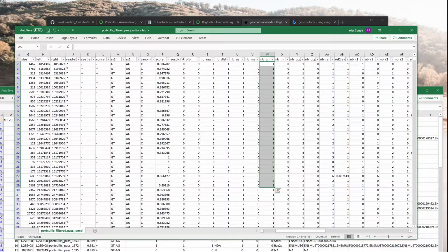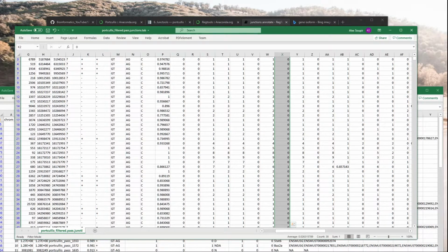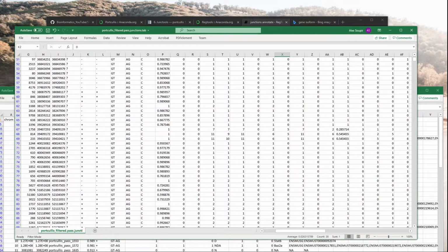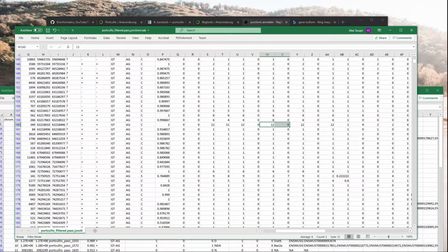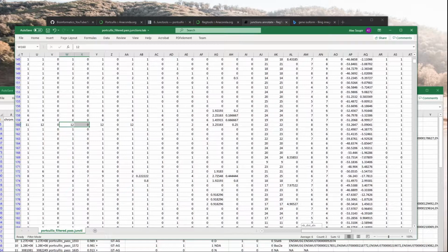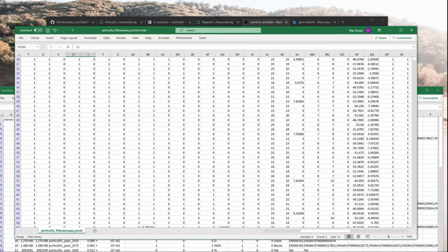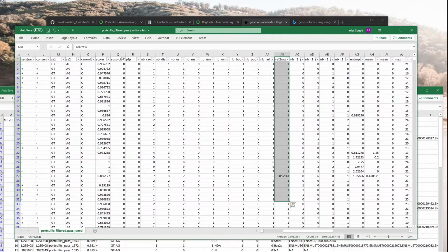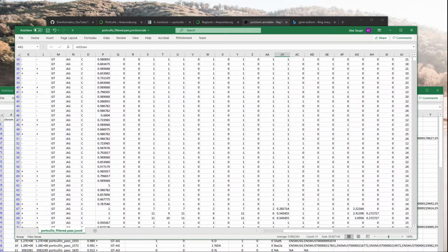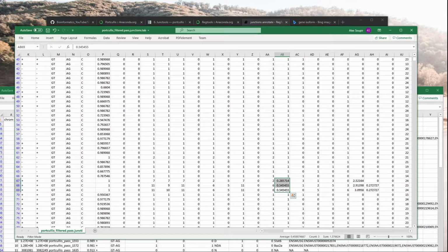So here the file was extremely small, but you have your unique mapping reads across this junction. And the higher amount of unique mapping reads from your multi-mapping reads, that ratio, the more likely that junction is probably real or has a little bit higher confidence. So like in this case, this is a really good junction. Let's see if we can find the rel2 raw, this guy, for the 12. So 54.